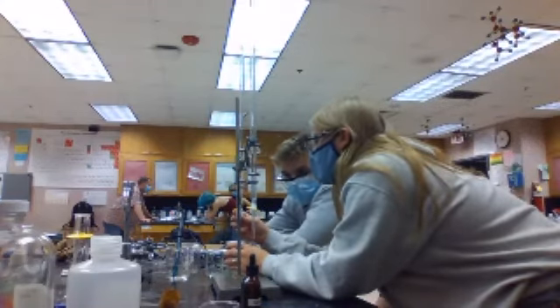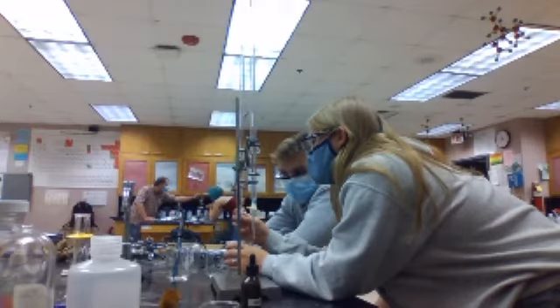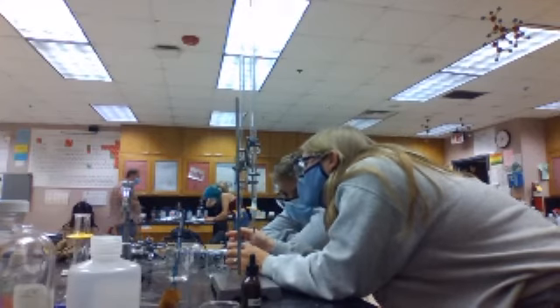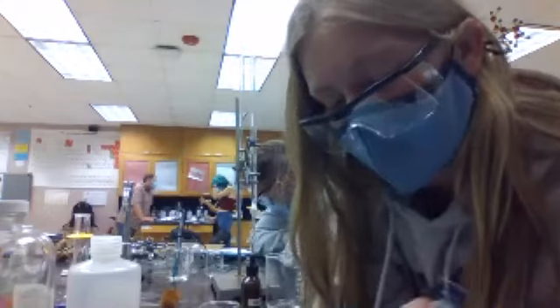Okay, but let us know if you do something like this. You have everything else though, right? What was it whenever you read it? 30. Hold on. So 38.5, and now it's what? So we take 49.5 minus 38. You made it way more difficult. Other than this, class is hard. You got extra math in. Or 51.11. Okay, and then the final volume of the acid is 51.11.